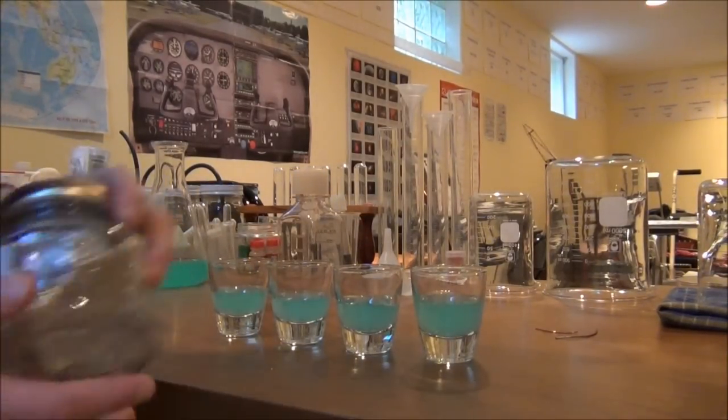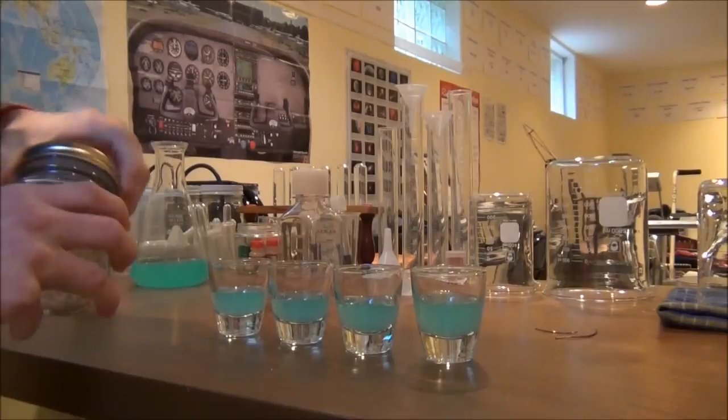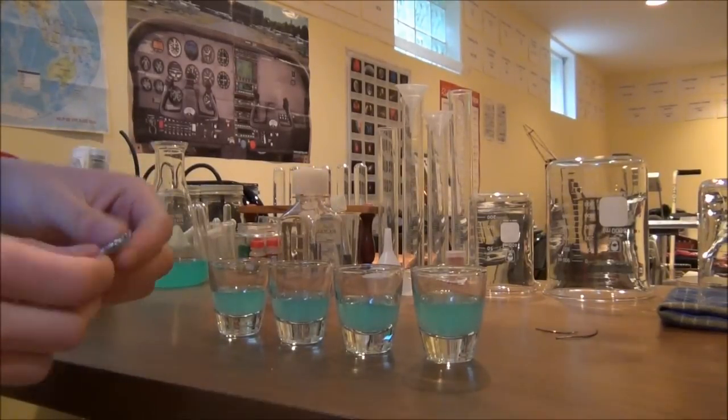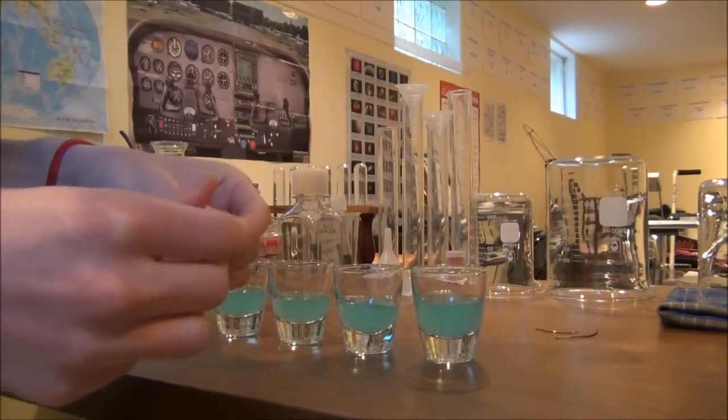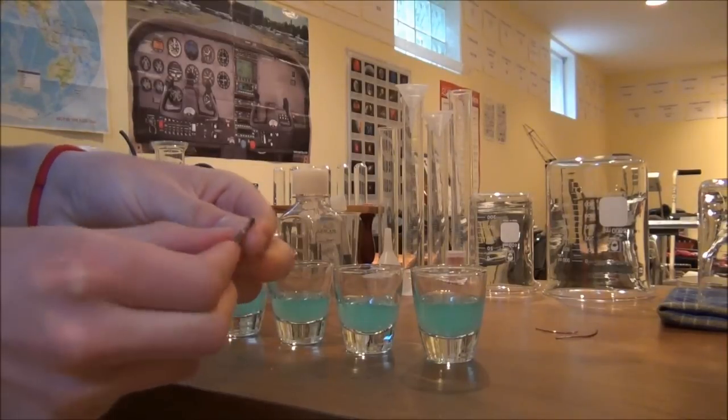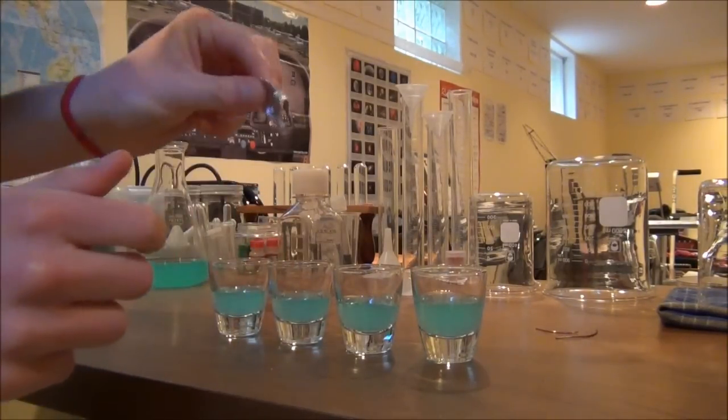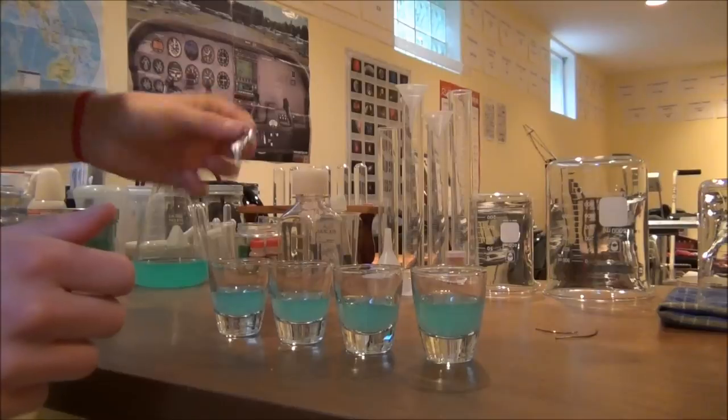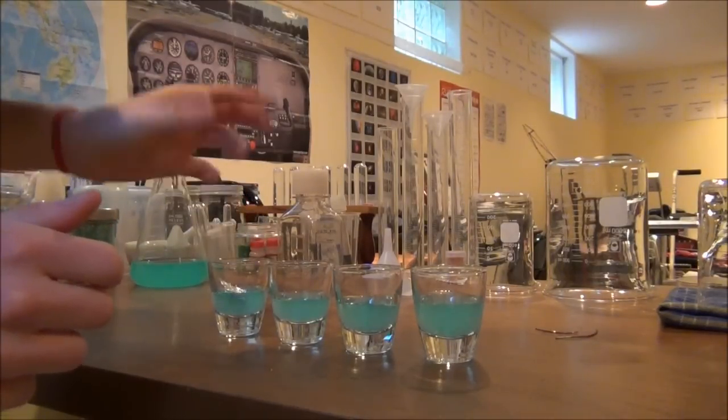So the first metal that we're going to be working with today is just aluminum and I'm just using aluminum foil. So we've got a little piece of aluminum foil. I'm just going to flatten it out a little bit and then we're just going to place it into our first shot glass with the copper 2 sulfate solution.